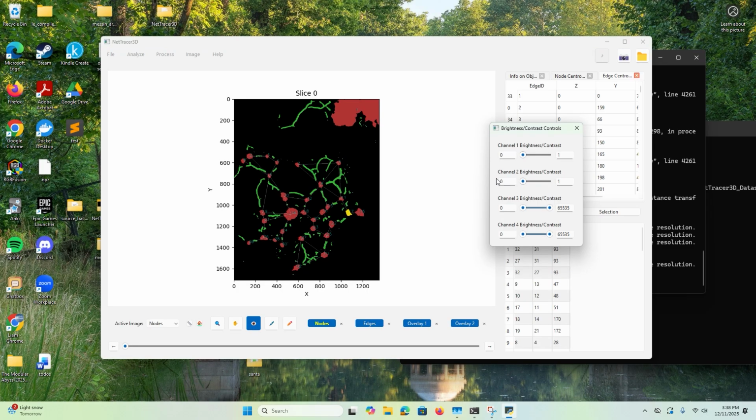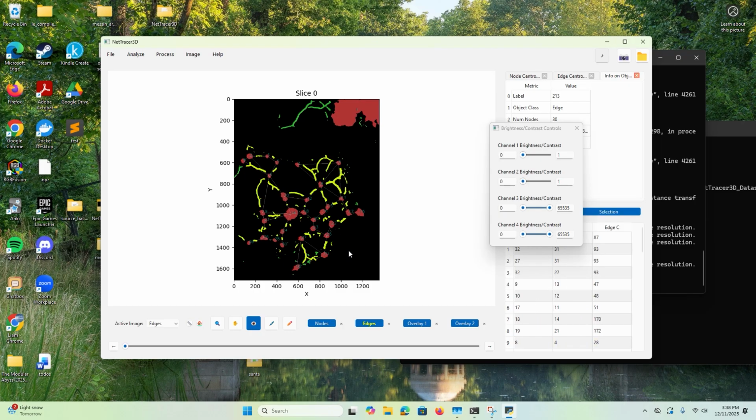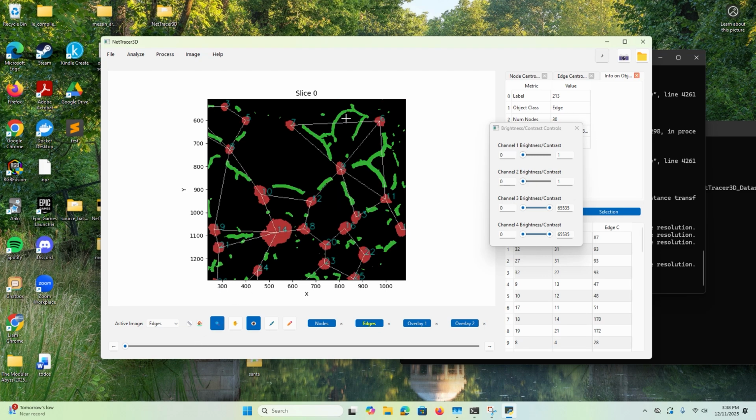So we can't see the edges anymore because they got new labels, but as you can see, it kind of chops them up like that. And this is mainly just for interacting with it. Because I removed the trunk, you can see that it went away up there. But when we look down here, we have some overlays generated, so it's saying these are connected.